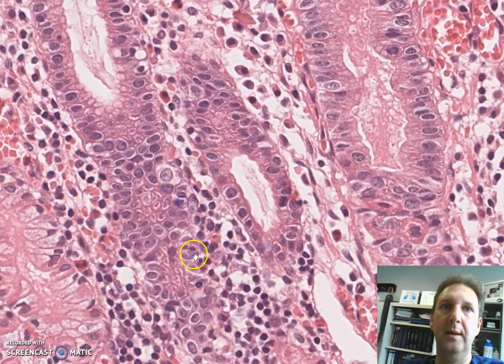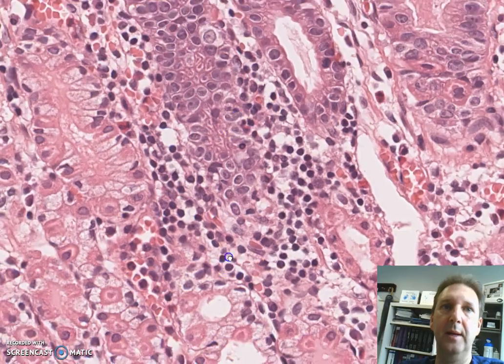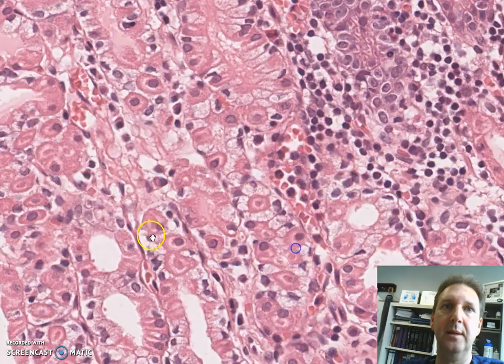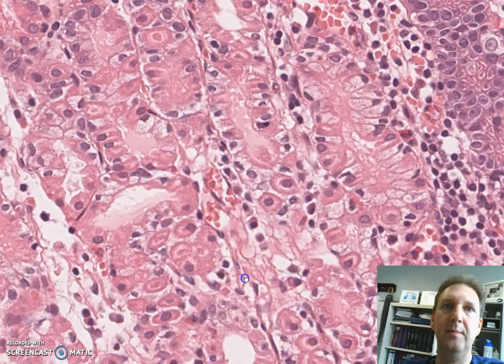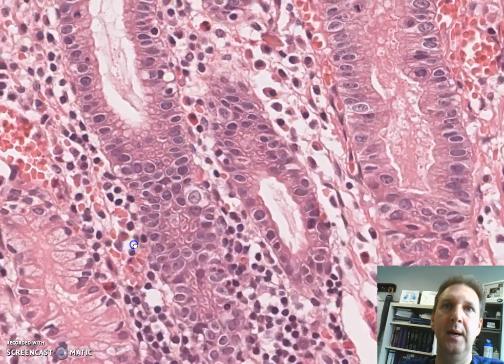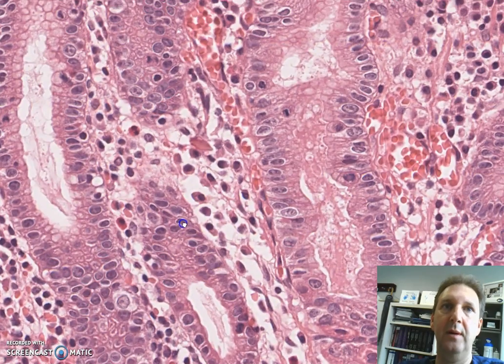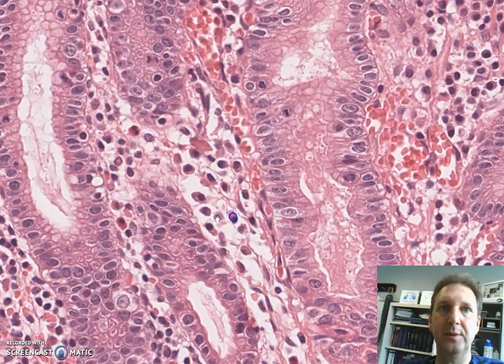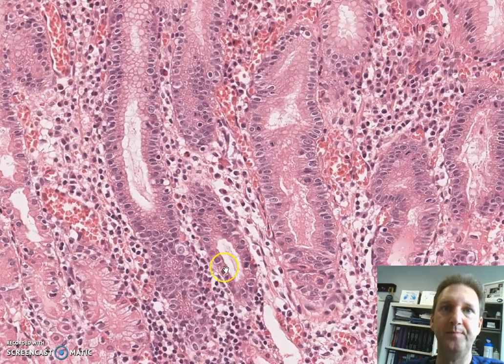The gastric crypts in between have the lamina propria that is composed of plasma cells, some lymphocytes, and occasional eosinophils.